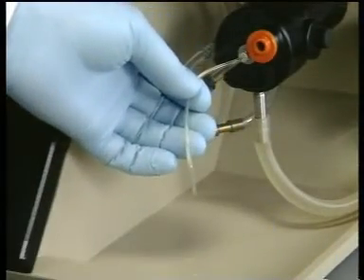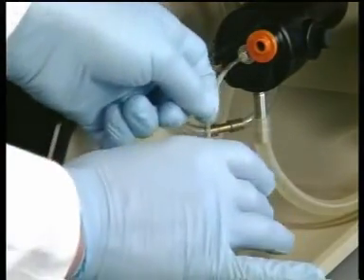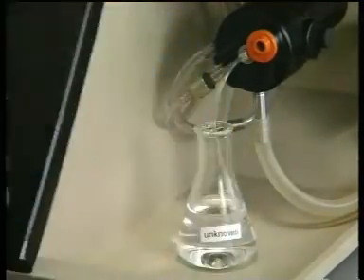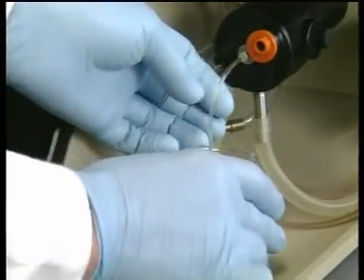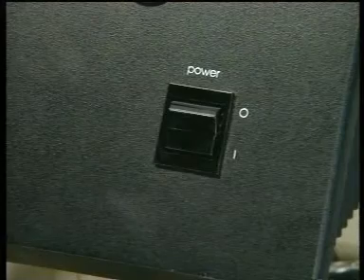Now aspirate the blank solution again. Then aspirate the unknown sample and record the meter reading. Finally, aspirate distilled water for a couple of minutes to thoroughly clean out the nebulizer. Then switch off.